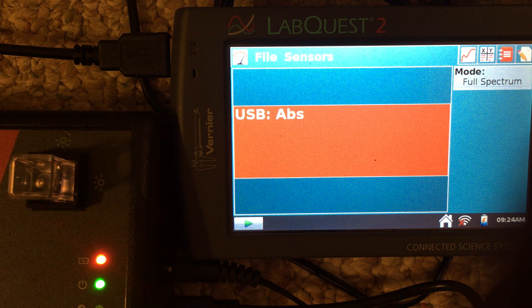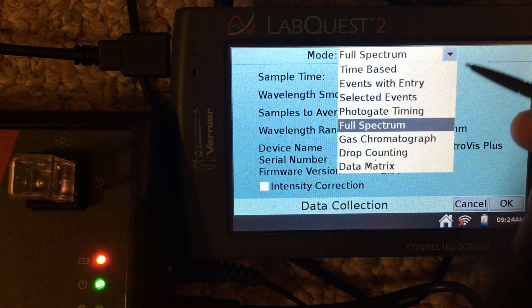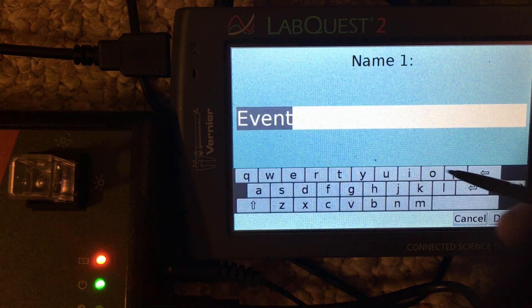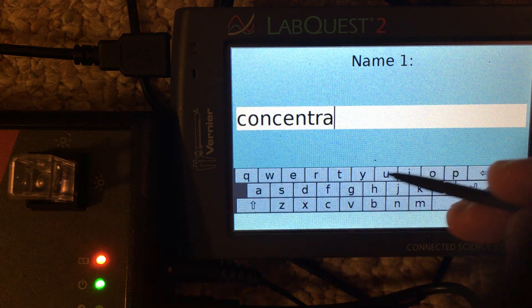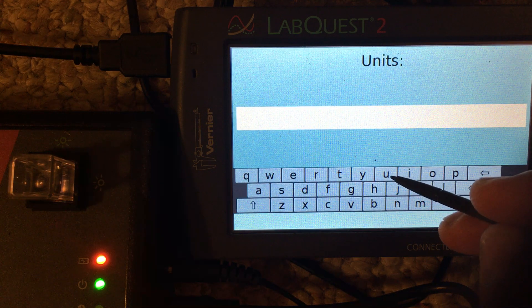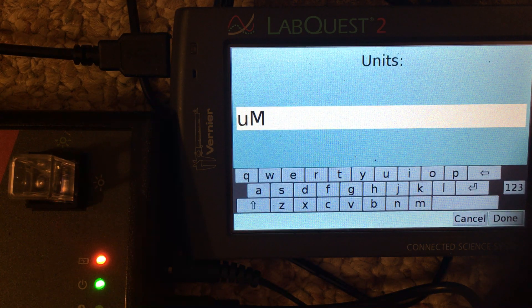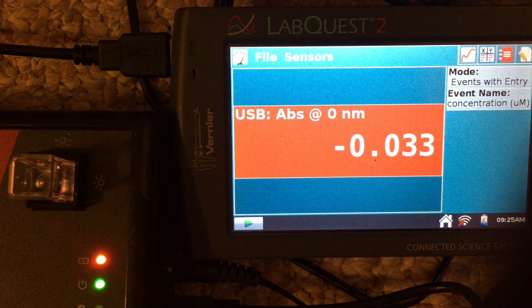While on the meter screen, we're going to tap mode, then switch to events with entry, and the name will be concentration. Our units will be micromolar — we'll use a U for the micro symbol and a capital M for molarity — and tap done, then tap OK.